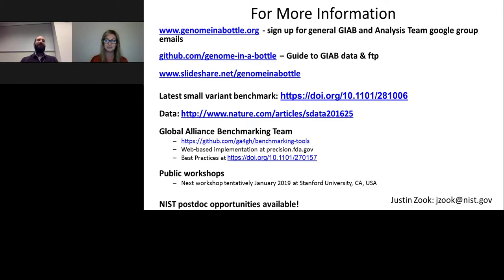Yeah, so we've definitely been talking with the people who are developing these methods using graph genomes. For those who might not be familiar with them, there are methods being developed where you can incorporate known variation in the population into a graph-based reference. So you don't just have a linear reference anymore, but it's now a graph that has multiple potential paths in it for the different variants that have been found previously.